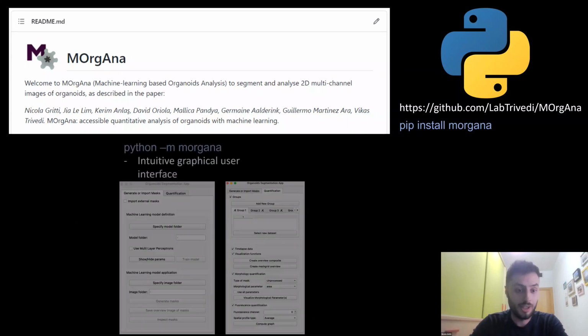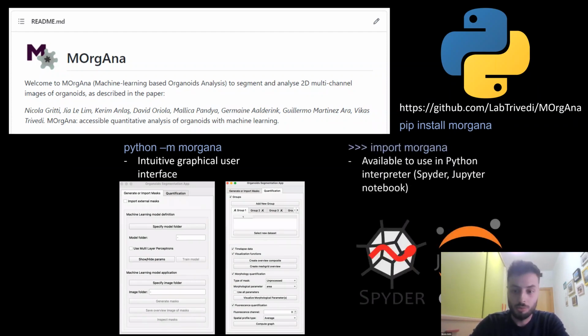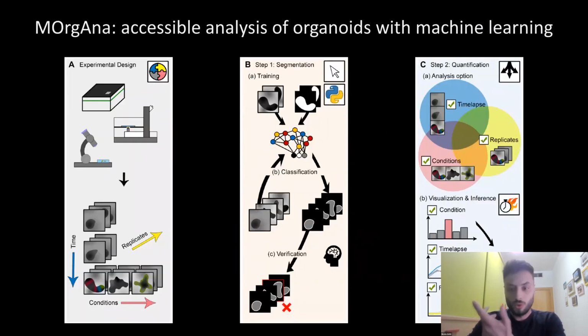Once installed, it can be run through a graphical user interface that allows users with limited coding experience to obtain results and quick visual feedback, or through scripting to perform more high throughput analysis and integrate the results possibly with some custom written code. In this case, we provide example scripts in the form of Jupyter notebooks. With this solution, we provide an accessible tool to start applying machine learning algorithms to the analysis of high throughput data that are acquired with a wide range of devices.